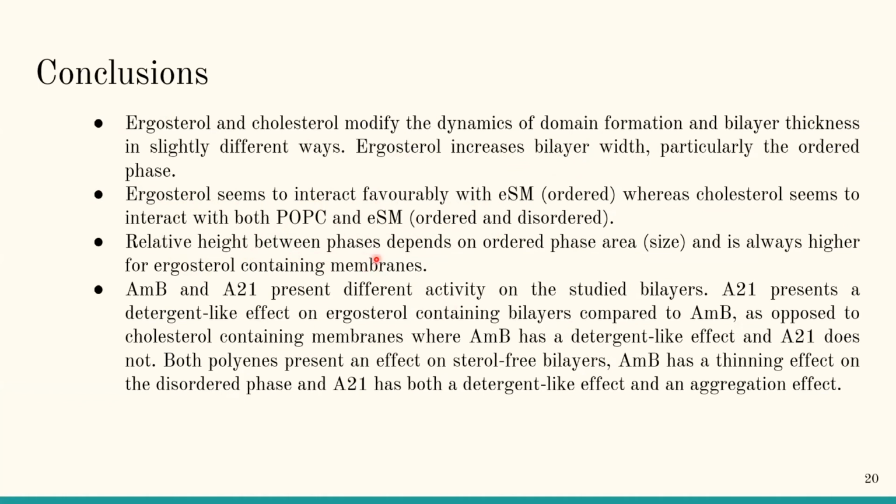Relative height between phases depends on ordered phase area, the size of the domain, and is always higher for ergosterol containing membranes. That is really interesting. It doesn't matter if the domains go very small. If there's ergosterol, the relative height is always higher for ergosterol containing membranes.